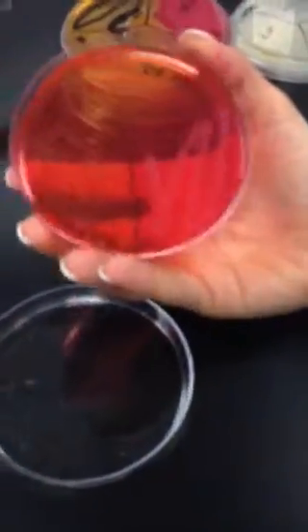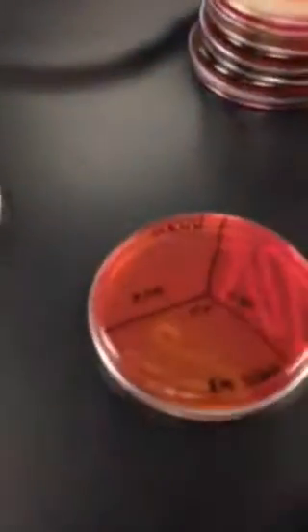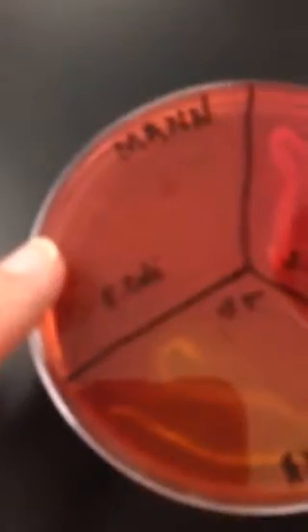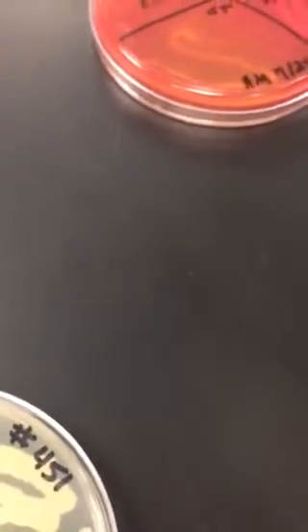Now, your gram-negatives should not have grown. They may grow a little bit. The salmonella actually grows a little bit, might turn your agar a little bit yellow, but you can disregard that. Just put no growth. But if you think you have salmonella, and it did turn your mannitol salt agar a little bit yellow, that happens. That might also help you identify it. So then at the bottom of this document, I wrote a few little sentences to summarize.